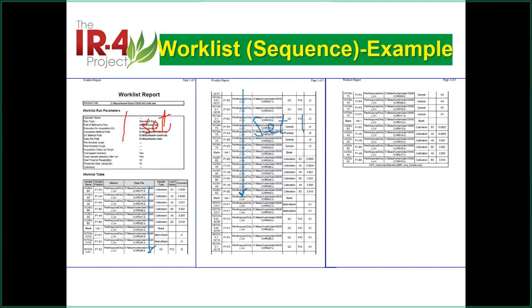And we do exactly the same thing. We count from here, go down to the end. That's called set 2. So basically, this part is in between. You can keep going, this work list, keep going. You can put 3, 4, 5 together. So this is an example to show you can have multiple sets in one sequence or in one work list.